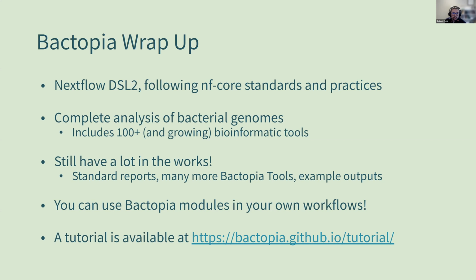And yeah, you can use any of these modules in your own workflows. I think that's pretty cool, that you don't have to use Bactopia. You can just take the workflows and run, which is pretty awesome. And that's the great thing about DSL2. There is a tutorial available if you want to give it a go. Don't hesitate to reach out if there's any issues. I'm always looking for feedback.